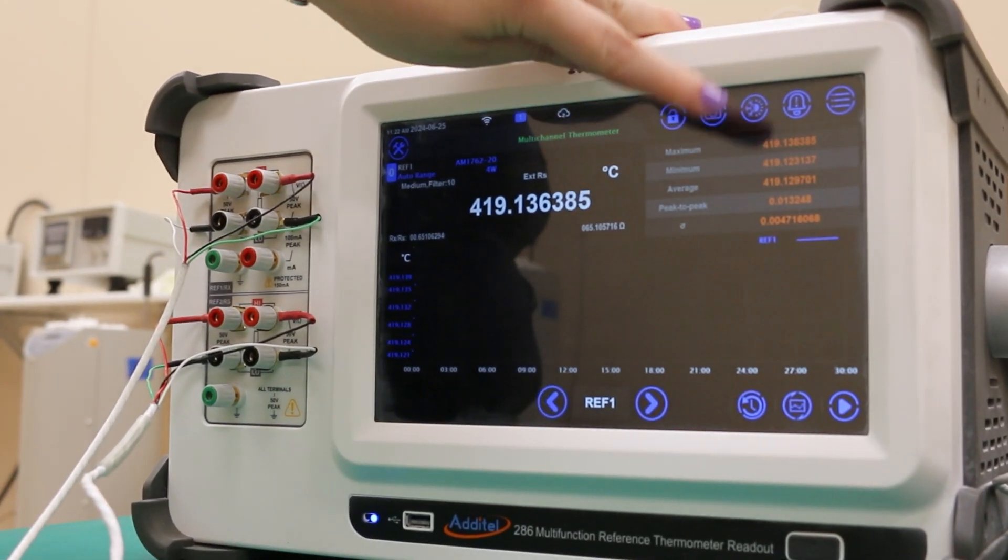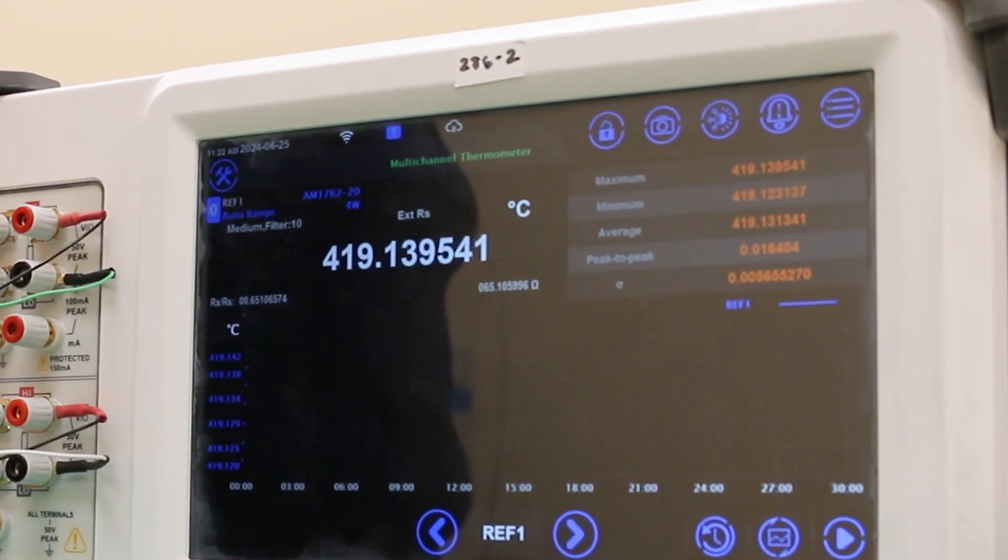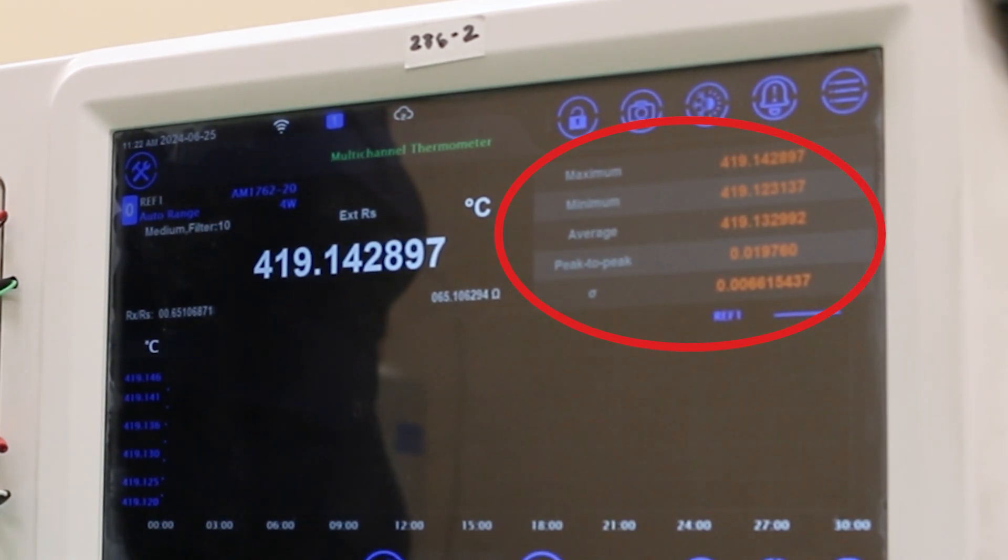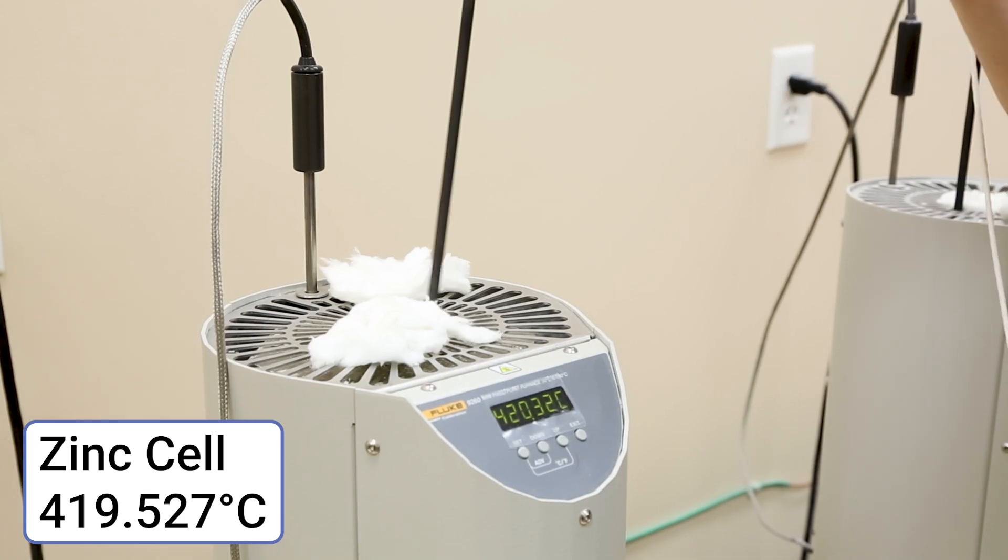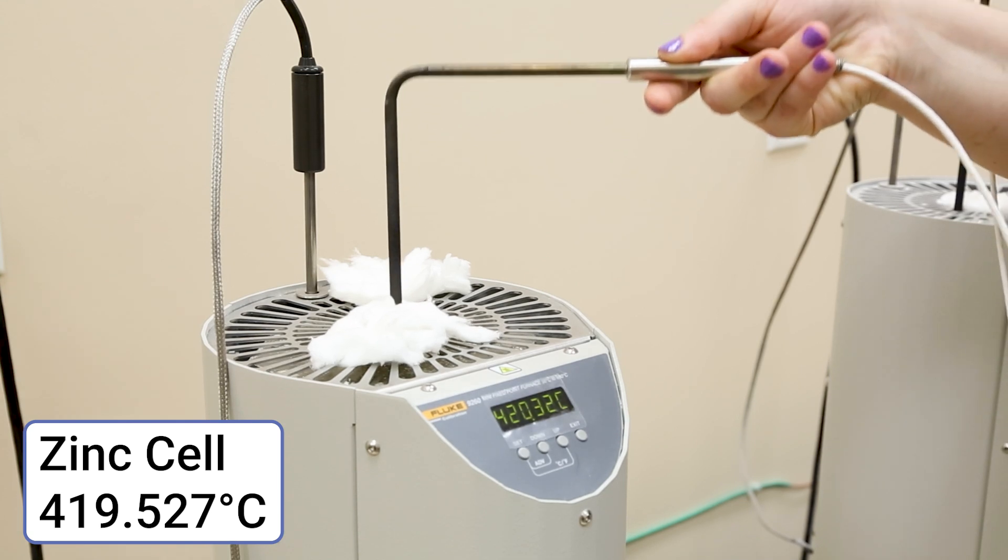With the check standard, we can also see important stability statistics in the top right table, such as average temperature and peak to peak difference of the high and low temperatures. We can now remove the check standard and replace it with the DUT probe that was on standby.